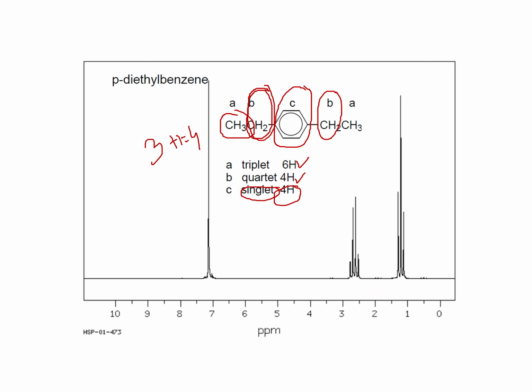That would be quartet. Always keep in mind, don't count the full. Don't count both of them. This is the rule. Okay, same for A. Don't count the CH2 CH2, just count one CH2 because both are symmetrical. Okay, if they were not symmetrical, then we could take this into consideration, but they are symmetrical, that is why we count in that way.